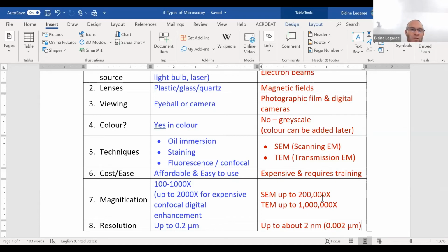A scanning electron microscope, right? There are some particular features around it. You're looking at the surface of a cell or the surface of an insect eyeball. In transmission, you're looking at organelles, so the internal structure of a cell or something like that. So make sure when you give examples that you are specific. It's very important in science classes that you are specific when you're discussing things.